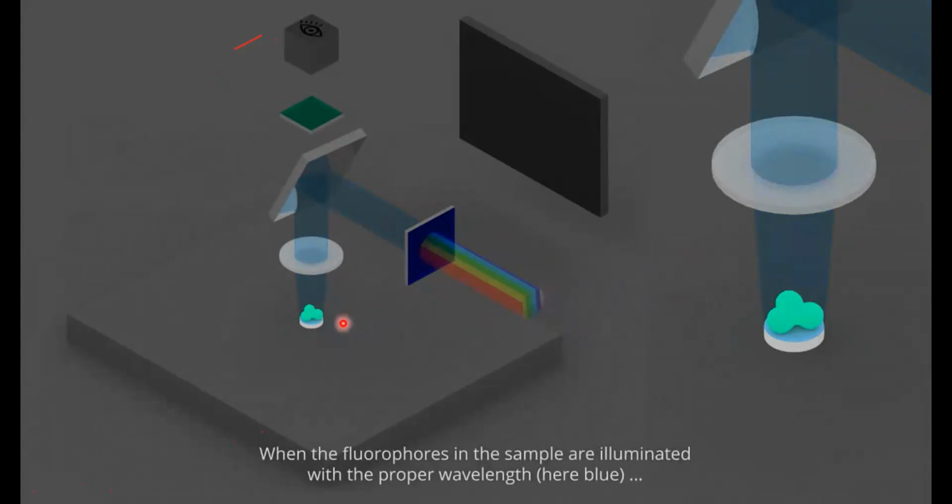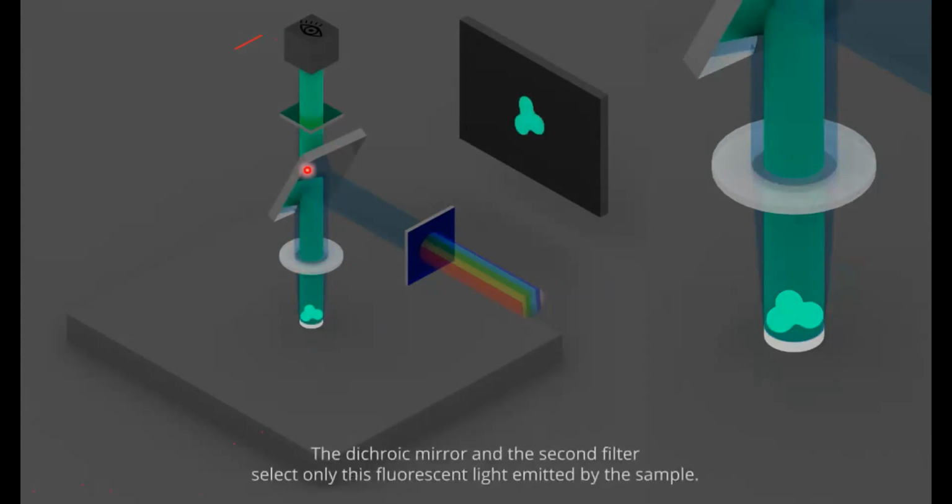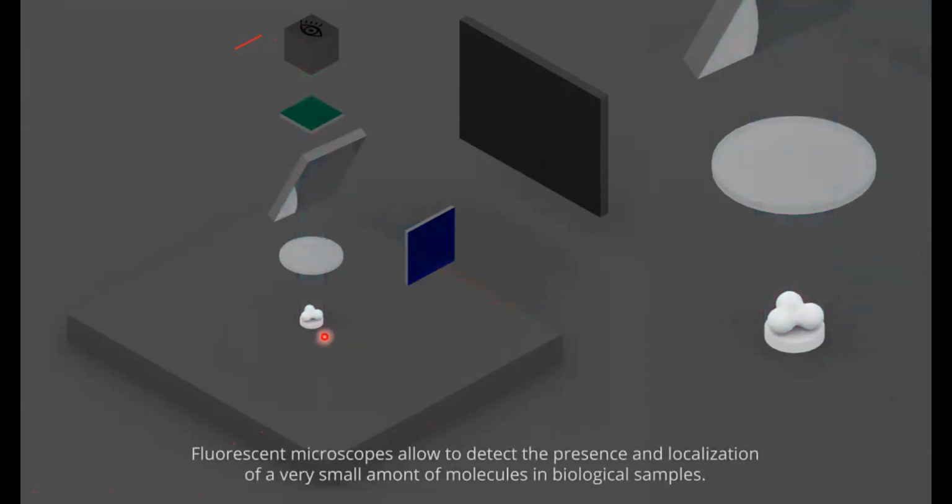Your sample is going to be excited by the blue light. It's going to emit some light, green light, which goes through the objective. It's going to go through this very specific mirror, through a filter, towards the camera. So people were saying light is reflected because it goes down and then it goes back up. But the reflection of light is a different thing. So this is why I call it fluorescence.